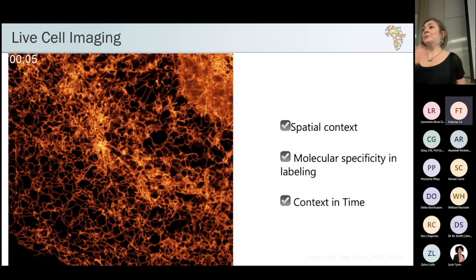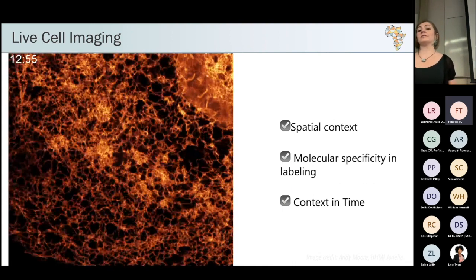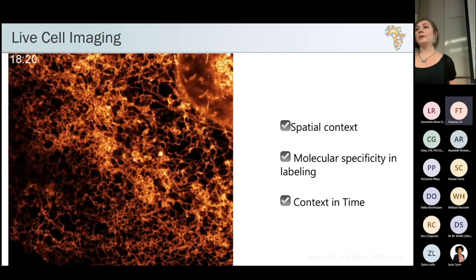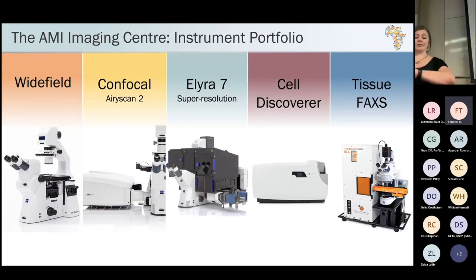And of course, the important thing is time as well. And with modern, especially fluorescent microscopy, we can do incredible investigations with live cell microscopy. So this is not a technical, as I said, I'm going to try to keep this to 5 minutes. I've probably used up 3 already.